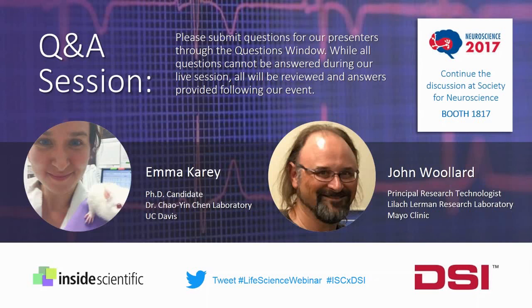I see. Okay. I would say we actually get better resolution. We were using that two standard deviation cutoff, and we could see some modest changes in vagal tone. And I think this has actually cleaned up our data so that we have a very small effect size in our mouse model as is. I'm talking maybe 1 to 3 milliseconds. So any sort of artifact or noise is going to potentially interfere with that enough that, with our statistics, we're not going to be able to detect anything. So we actually found better resolution with this 20% cutoff in the same data set compared to the two standard deviations. So we actually feel really confident that we are capturing changes in vagal tone appropriately. Very good. Okay.